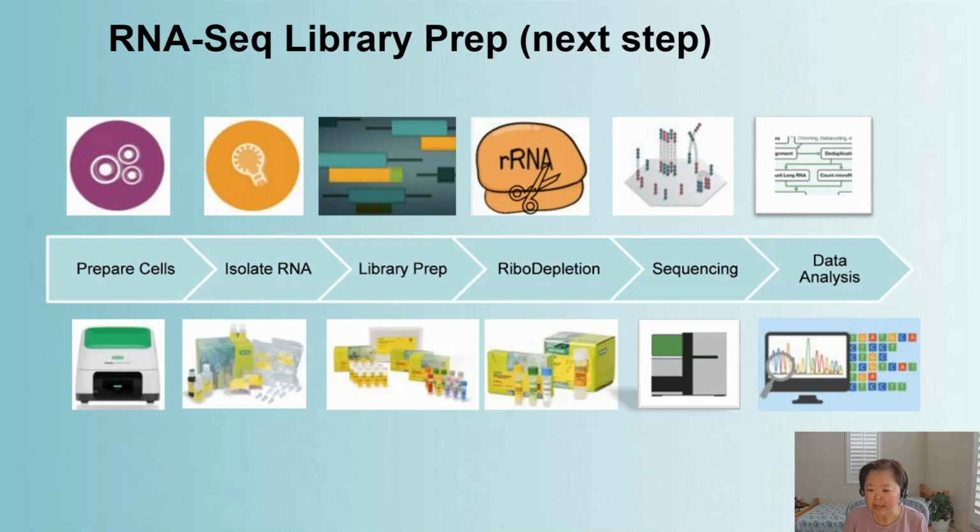At the end of the study, we expect to show not only the concordance data of the expressed genes using the qPCR and NGS method, but also the performance of the Sequoia workflow in capturing both long and short RNA from the rare cell samples. So stay tuned.